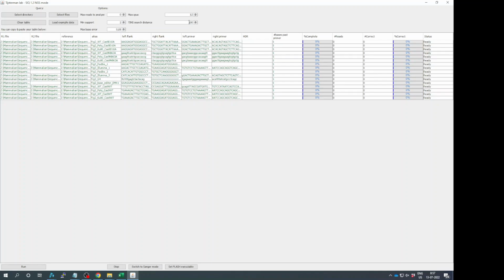And if you increase the search space, the likelihood of finding a larger match increases. So smaller is better, but if you make it too small, it will also miss templated inserts. So we've chosen now for 100, which seems to work well, but if you are in doubt, you can of course always change this number.